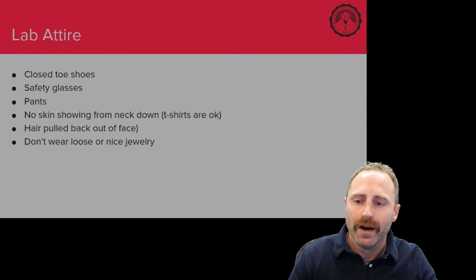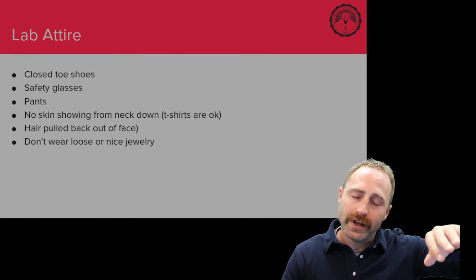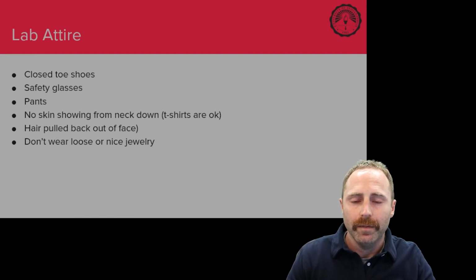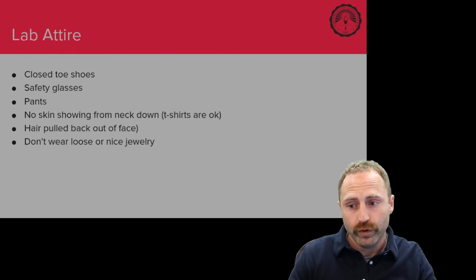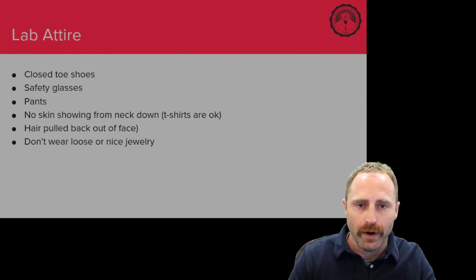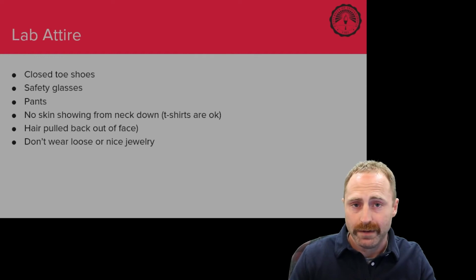First off, wear closed-toed shoes. These need to be something that completely covers your foot. I know that shoes like Tom's and some flats will have the top part of your foot exposed. You don't want to wear those in the lab. You don't want to wear anything other than a closed-toed shoe. That doesn't mean you have to wear a boot, but a tennis shoe is highly advisable. A flip-flop is completely out.